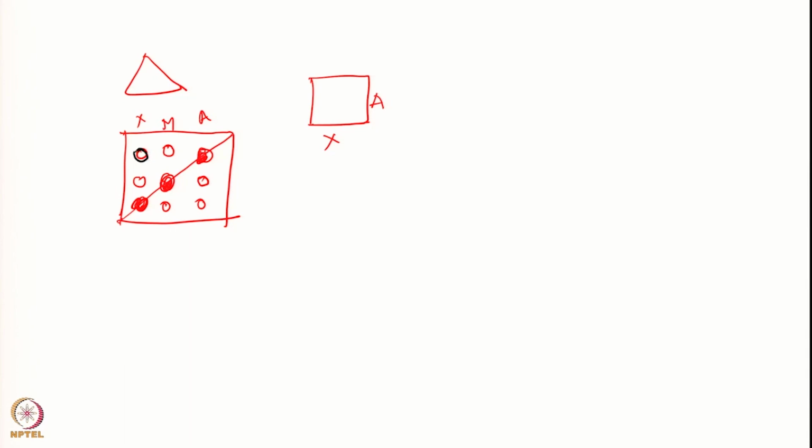Ax. So what will be the active coupling here? Here J_AX is the active coupling, because this cross peak is arising as a result of coupling between A and X. This is the same here.